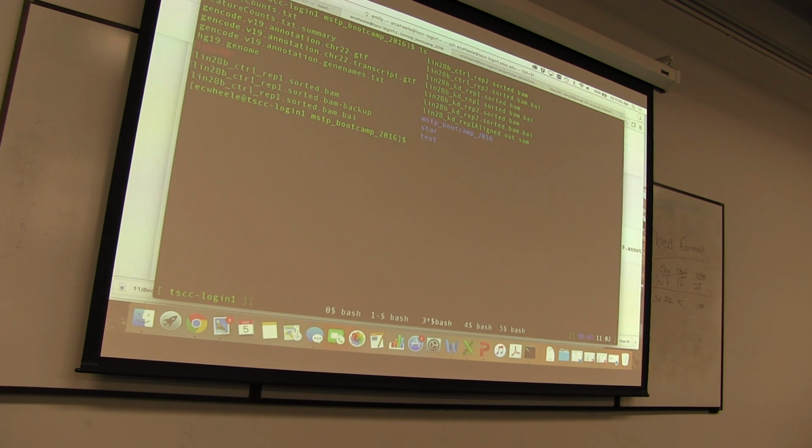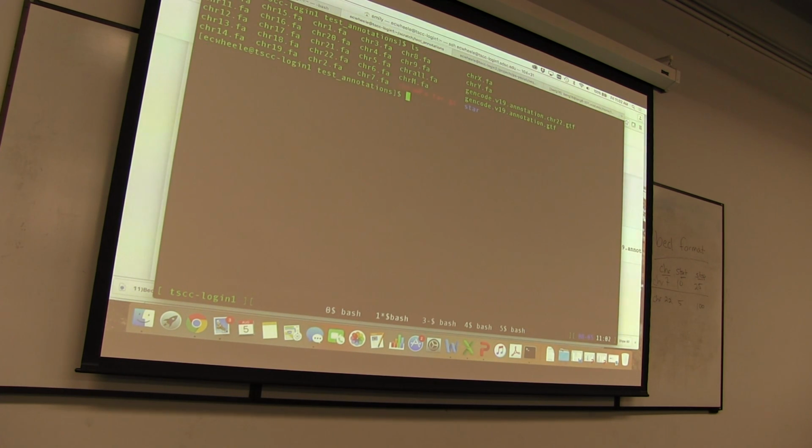So the GTF and the transcript GTF are both in there, and I'll add the bed file.